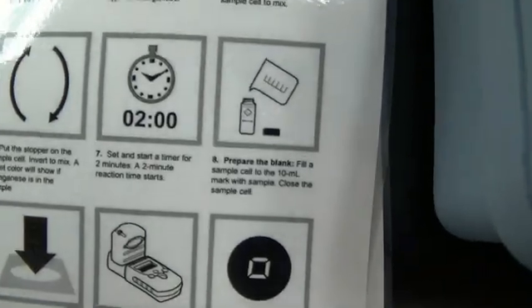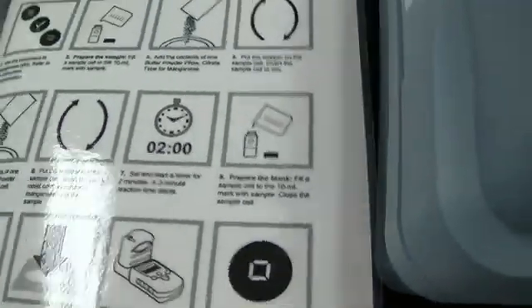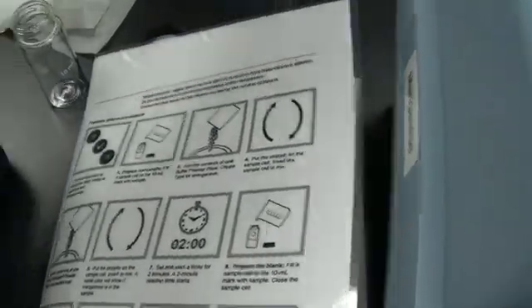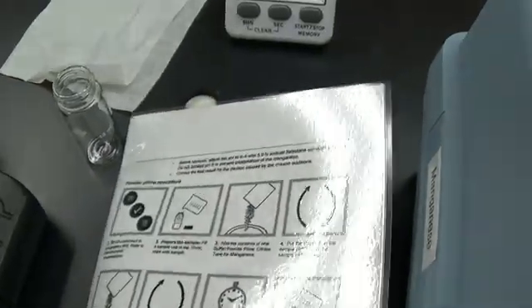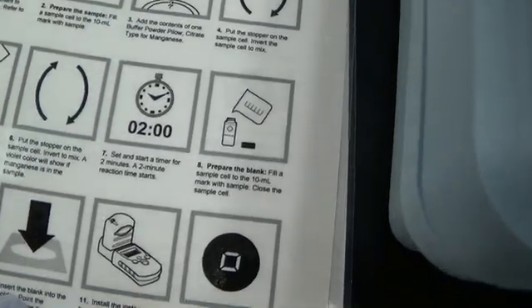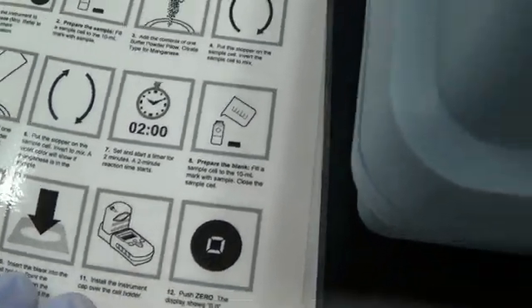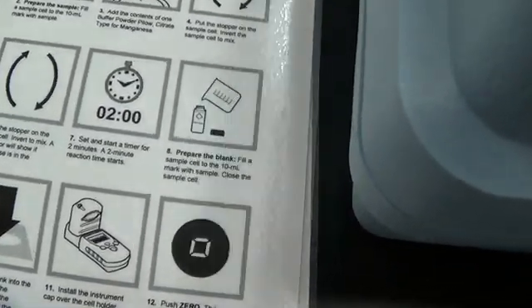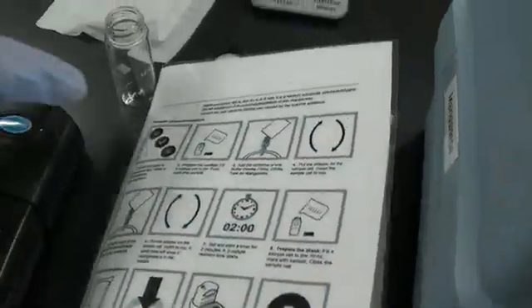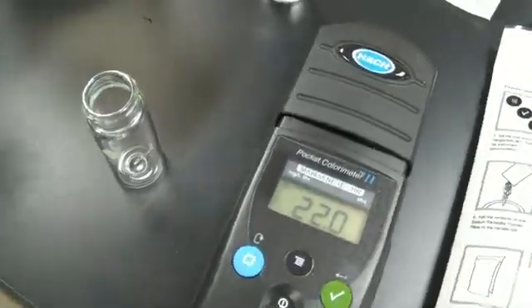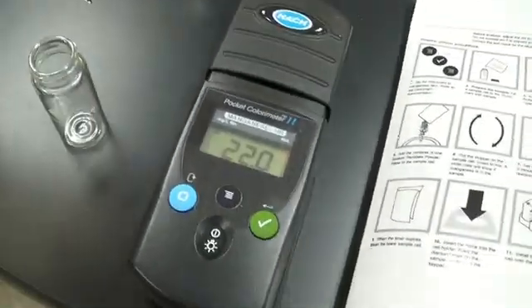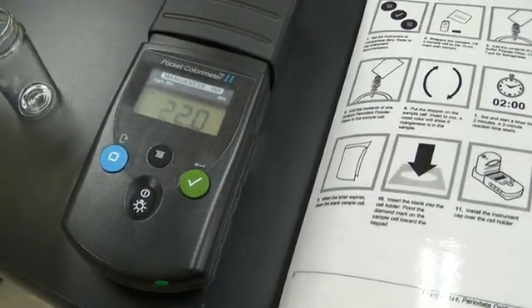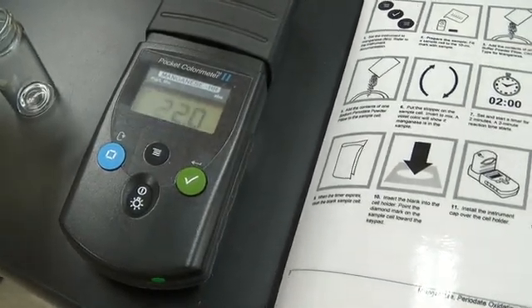Set the timer for two minutes. Next, we're going to prepare a sample blank. Fill the sample cell to the 10 mil mark with sample. Then close the sample cell. Move it over here to keep my blank separate from my test.